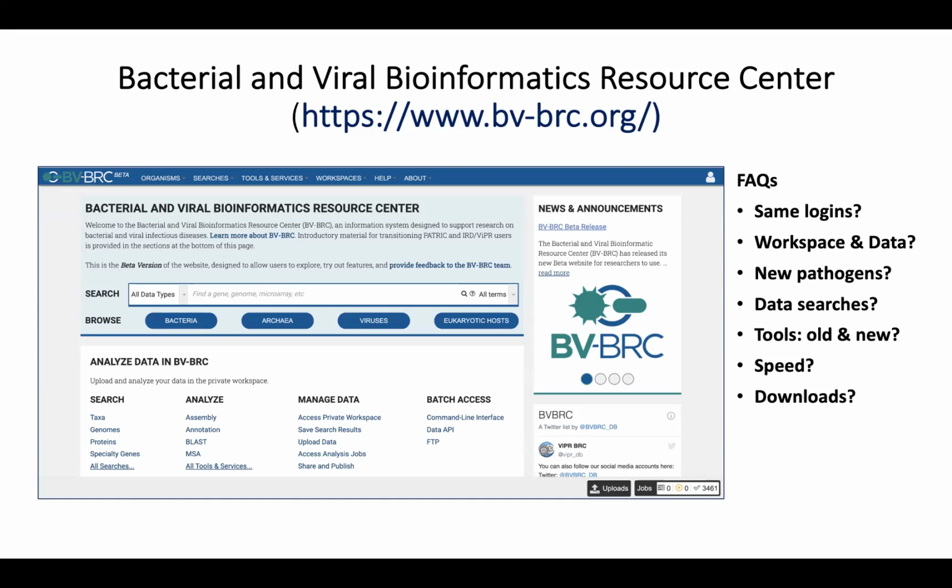And if you do find a bug, I encourage you to get in touch with us and let us know what problem you're having so we can fix it. But almost all of the tools that you can find in Viper and almost all the services have been ported over, and those that haven't will be by the end of the year. And in addition, you now have access to several new tools that you didn't have in IRD and Viper before. And again, I'll be introducing those.